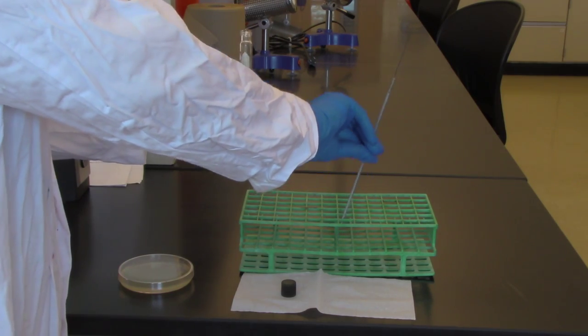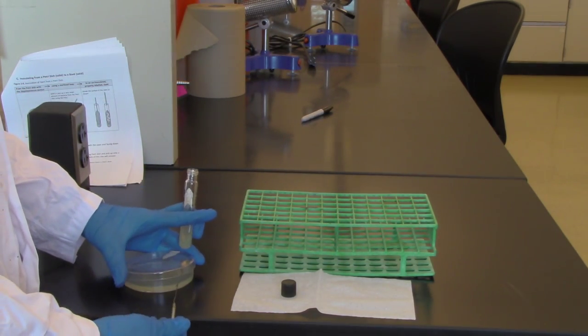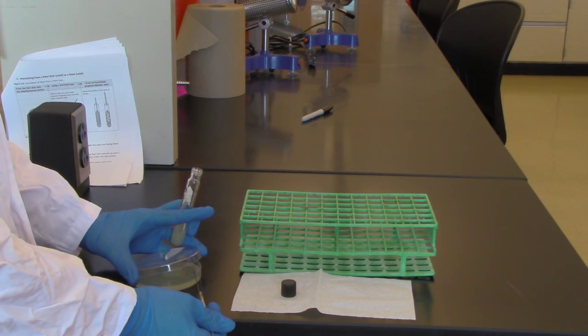Now I'm going to pick up my loop, come over to my petri dish, and do what's called a clamshell. I'll just lift the edge just enough so that I can get the loop in.